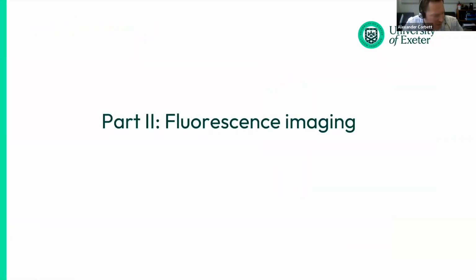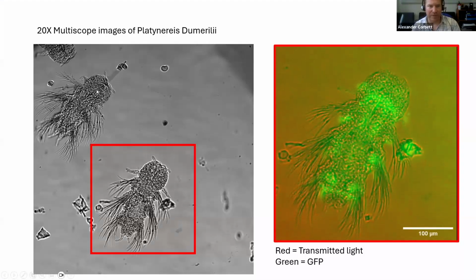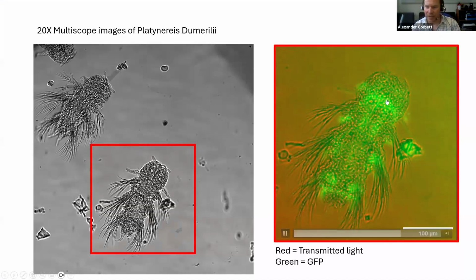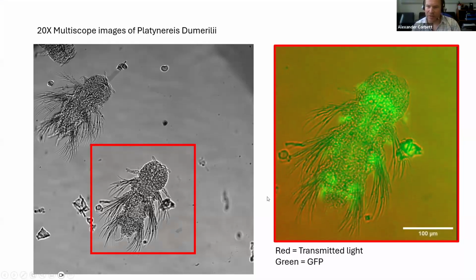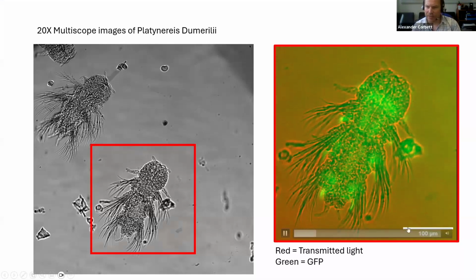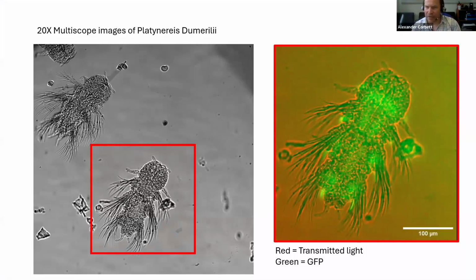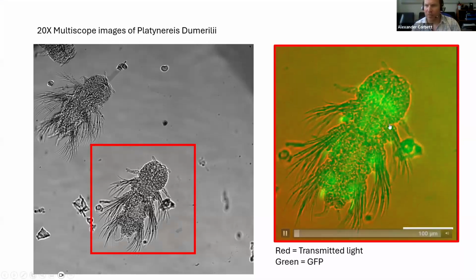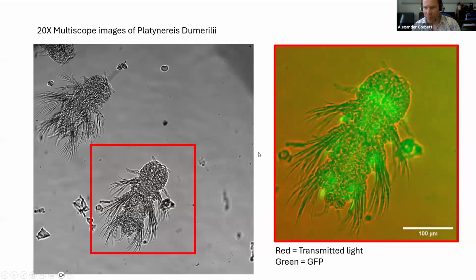So I'd mentioned we'd look at fluorescence imaging. Here on the left, we've got another higher magnification view of these annelid worms. On the right, we have a shallower Z stack through one of them that's expressing this GFP in its nervous system. We combine these two views here. So this is, again, wide field fluorescence imaging. We're not seeing distinct optical sections, but by taking a Z stack, we can get a feel for its distribution across the animal.